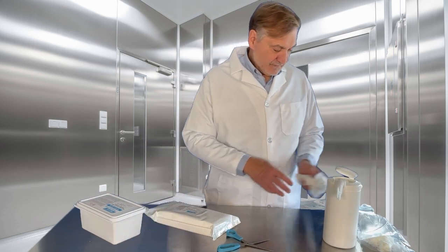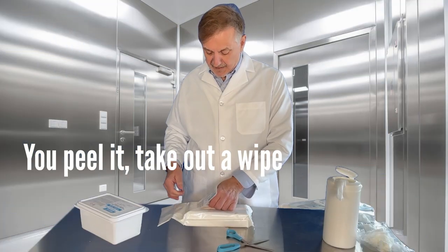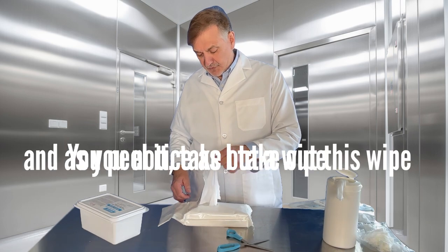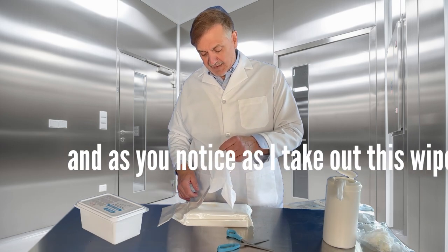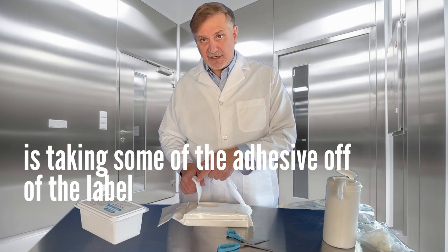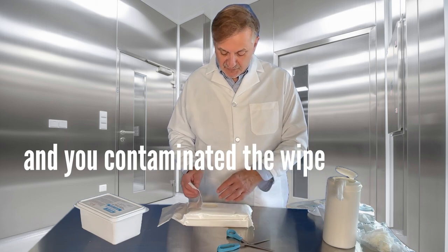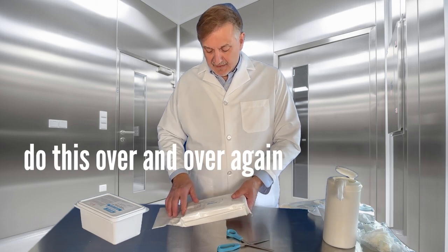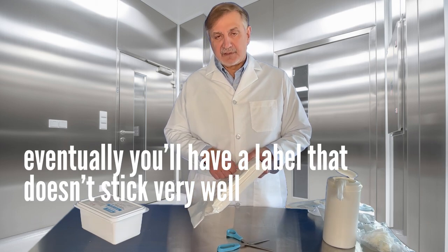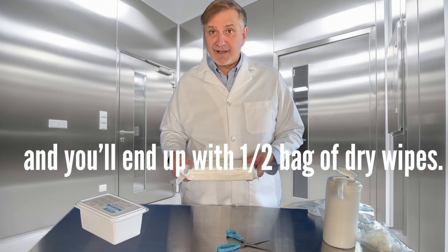Another type of pre-saturated wipe package is the peel and reseal. You peel it, you take out a wipe, and as you notice, the pre-saturated wipe with alcohol to some degree is taking some of the adhesive off the label, and you contaminate your wipe. Do this over and over again and eventually you'll have a label that doesn't stick very well, and you'll end up with a bag of dry wipes.